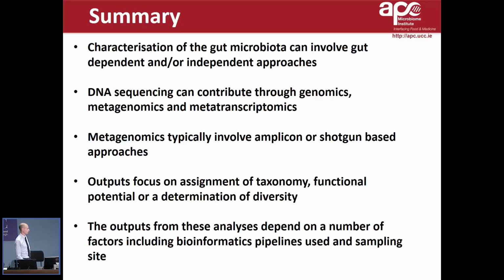But if I've gotten you to leave today with just one particular point, I hope that point is that the outputs from those analyses depend very much on quite a number of different factors, and those include the bioinformatic pipelines used, to a certain extent the sequencing platform used, sampling site, and a number of other things like DNA extraction kits, storage of samples, and so on.